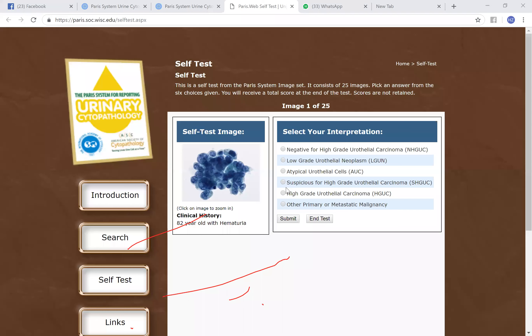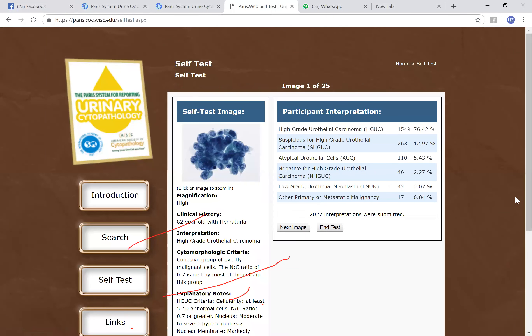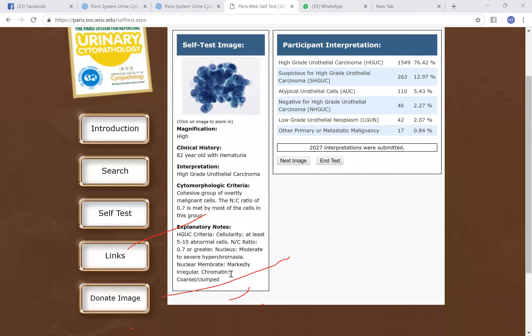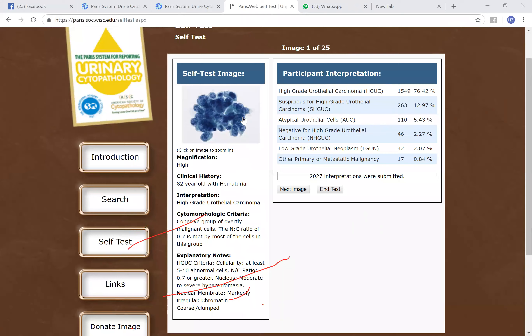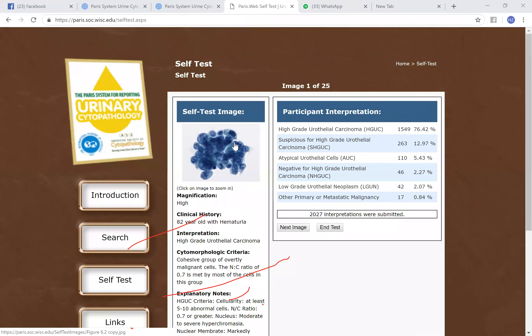This looks like high-grade. When you submit your answer on the website, it shows that 76% of participants called it high-grade, 12% called it suspicious, and so on - along with an explanation of why it is considered high-grade. Urine cytology is not easy, but practice is the key. The recommendation is for all pathologists and doctors to go through the 25-question exam on the website many times, as that will be very helpful.